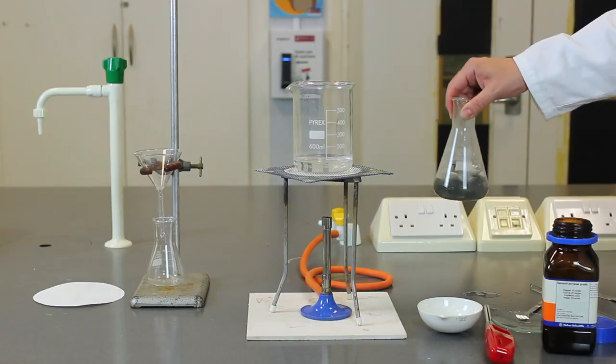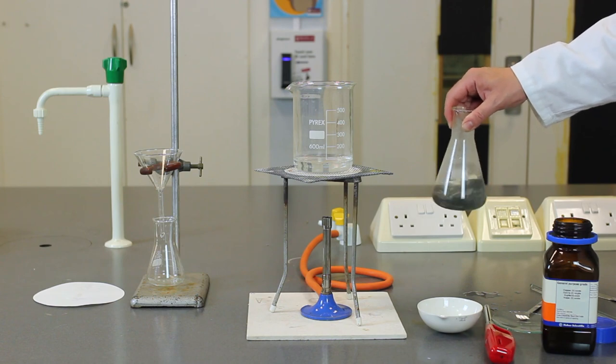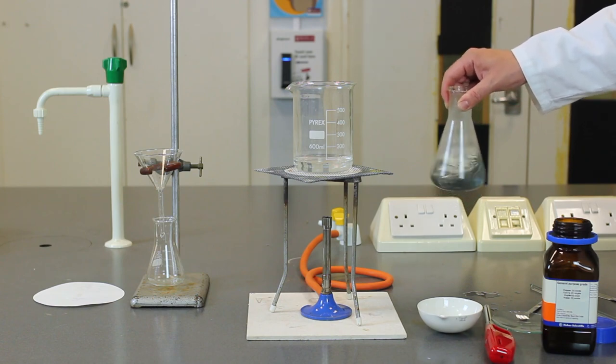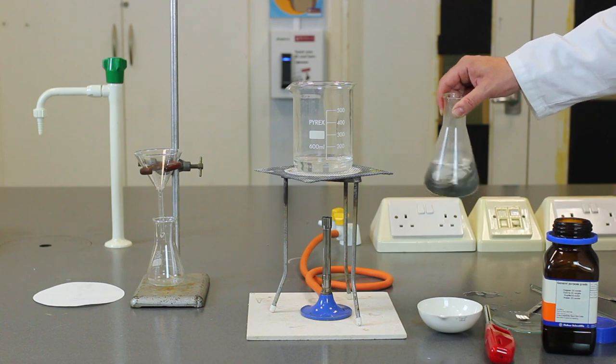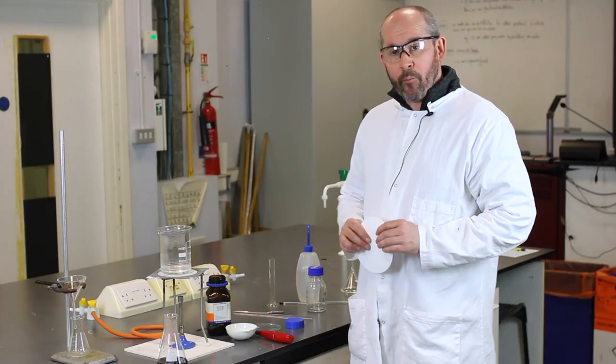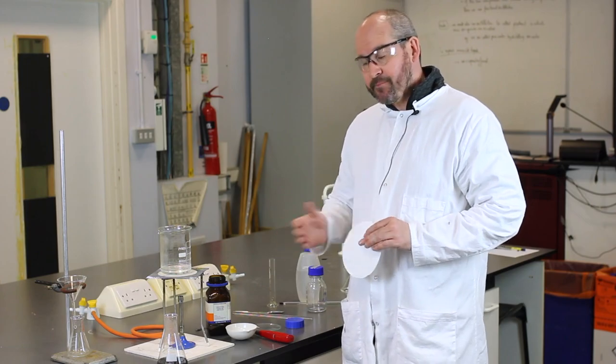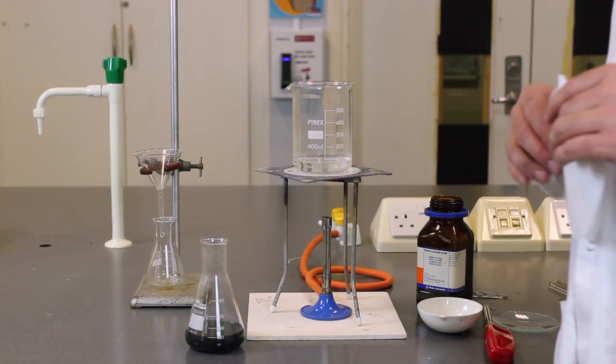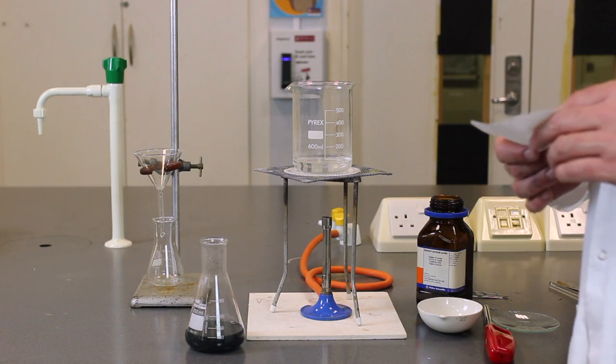It's a sort of bluey-grey colour. But the grey colour is obviously due in part to the presence of the black copper oxide that we've added. So at this stage we know that the copper oxide is in excess because it's no longer dissolving. And you can see that from the black colouration of the mixture.